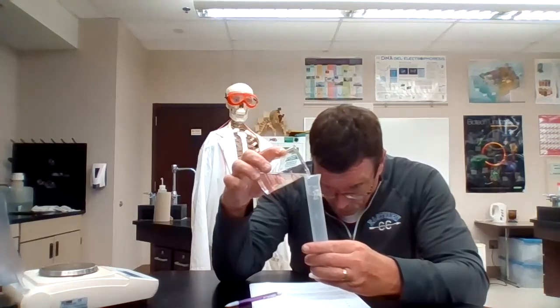Slow and steady. Science is very exciting. There we go. The mass of 10 milliliters, 28.64 grams.